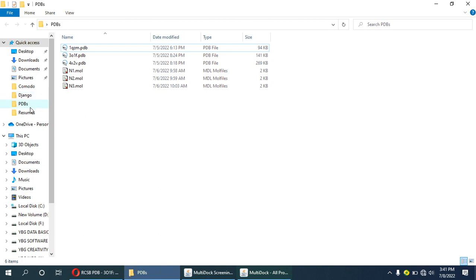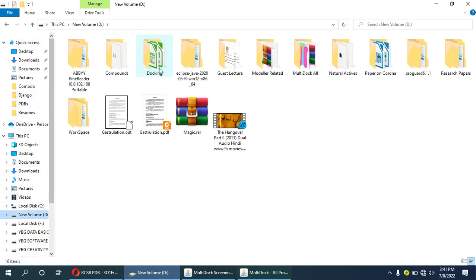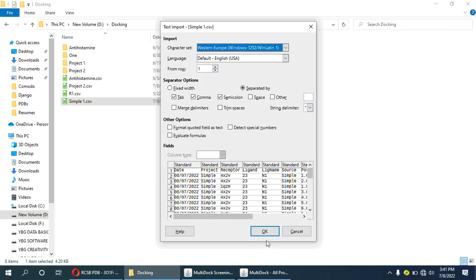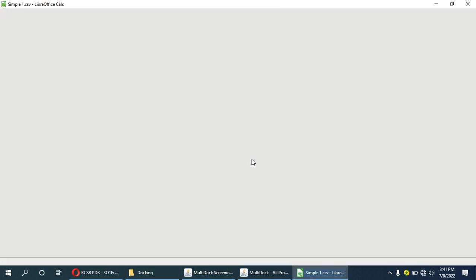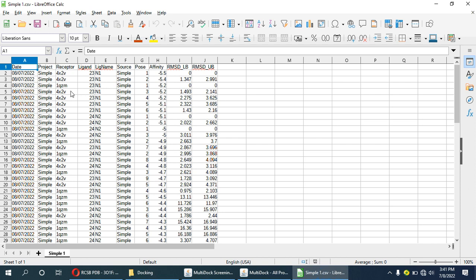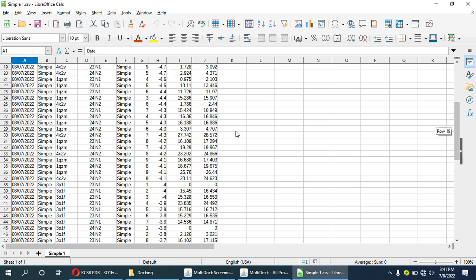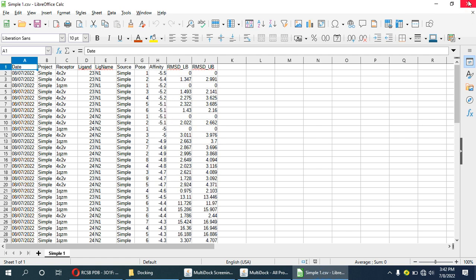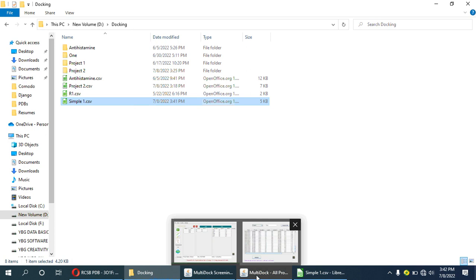The results file contains the following fields: product name, receptor, ligand, ligand name, source, pose, affinity, RMSD lower bound, and RMSD upper bound. All the results are here and we can further analyze this result.